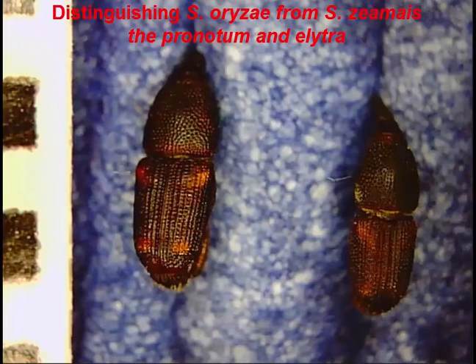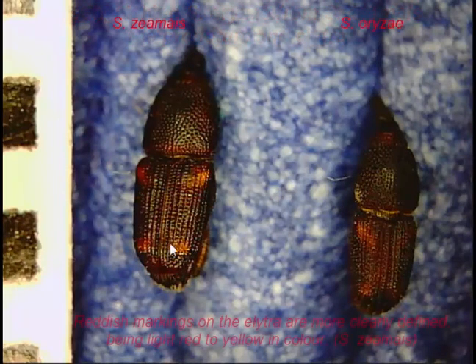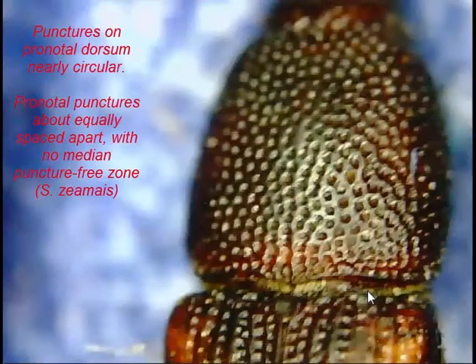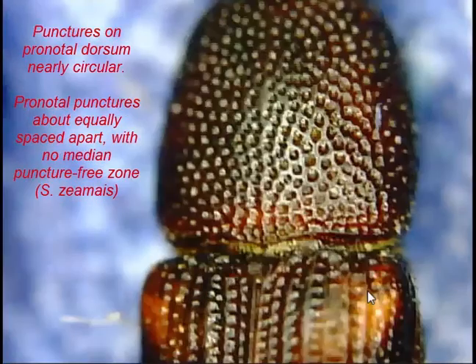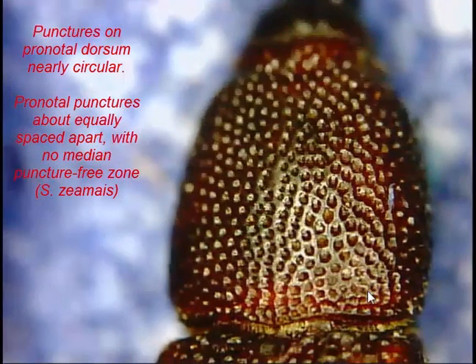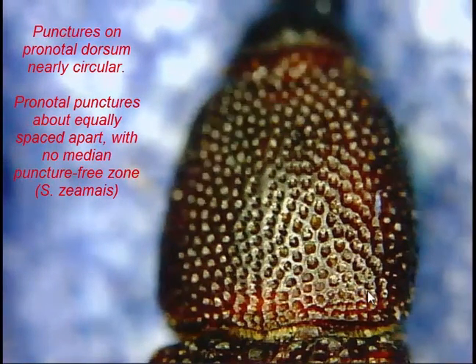Now the more difficult comparison is Sitophilus zeamais versus Sitophilus oryzae. We have Zeamais on the left. You'll notice that the four spots on the elytra are a little bit brighter, whereas in Oryzae they're more blurred, giving almost a crossed effect. Looking at the pronotum of Zeamais on the left, the punctures are fairly circular, very close together, and there aren't many bald areas.